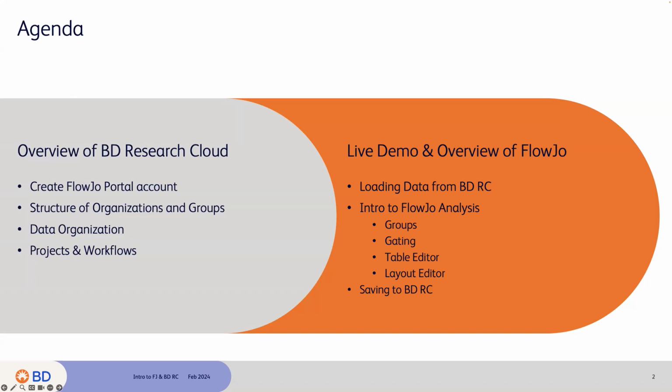We'll load in some data from BD Research Cloud, and then get into a basic intro to FlowJo analysis. So we'll look at creating groups, drawing gates, using the table and layout editor, and then saving that information back to BDRC.